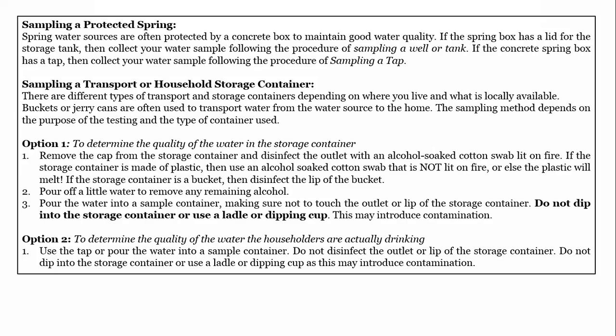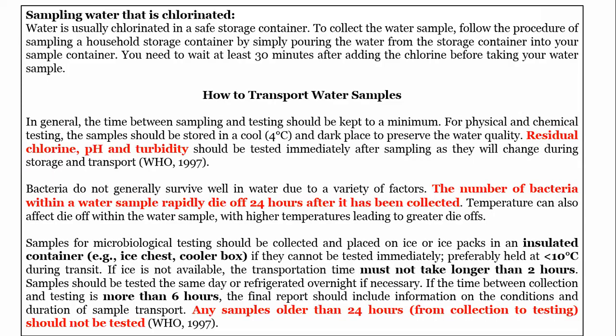And we also have here how to transport a water sample. In this aspect, to be able to transport our water samples, we must have particular equipment, like a cooler, a flask with ice inside. With this cooler, you put your sample containers inside. We have to keep a particular temperature to preserve our sample before taking it to the laboratory. This temperature must be lower than 10 degrees. Most of the time, this cooler must have a temperature of 4 degrees.